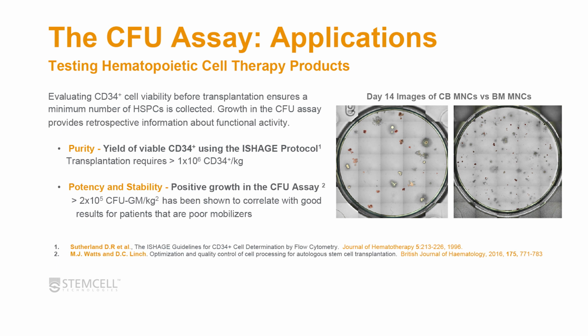Waiting to see the success of the transplant is another. You won't actually see the success of a transplant until about 2 to 3 or 4 weeks after the patient has been injected. And at that point, if you've set up the CFU assay at the same time, you have confidence as to whether it was the cells that were the problem or everything else that the patient has to go through in the transplant process.